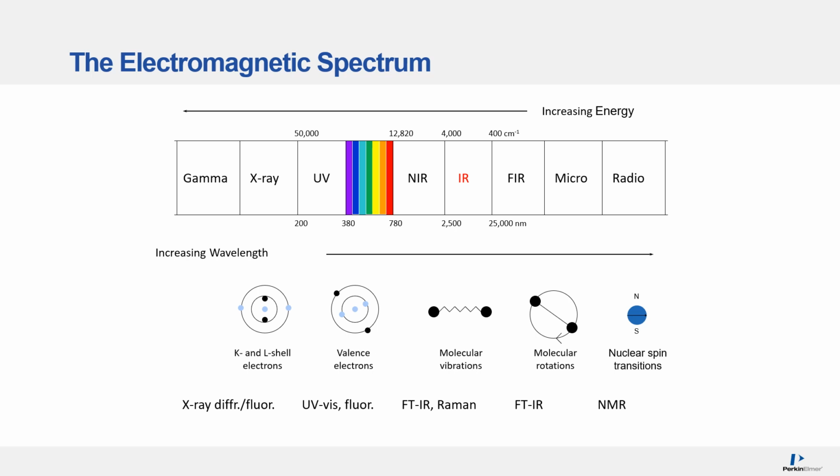And these comprise the UV, visible, near-infrared, mid-infrared and far-infrared spectral regions. These regions are significant as they are the regions responsible for interacting with molecular bonds and electronic transitions, which then tell us something about the makeup of the molecule.